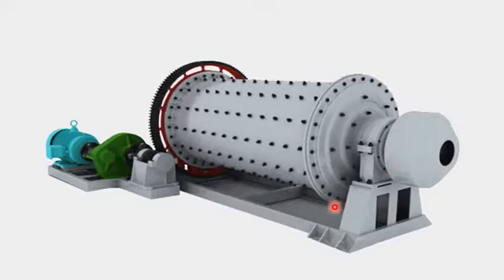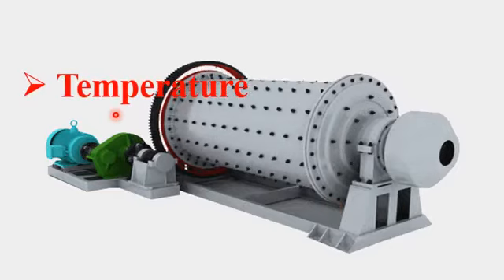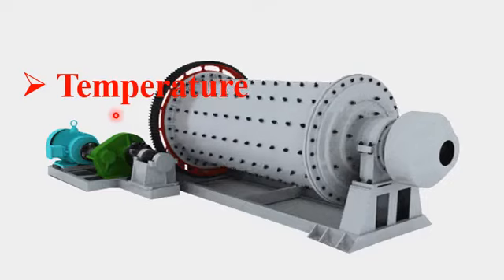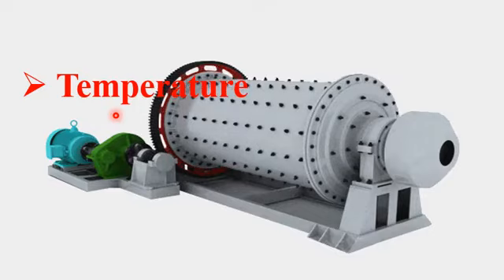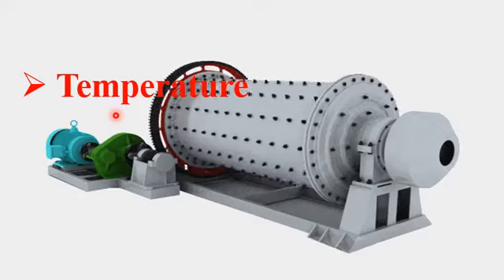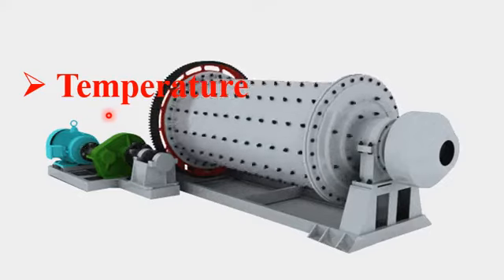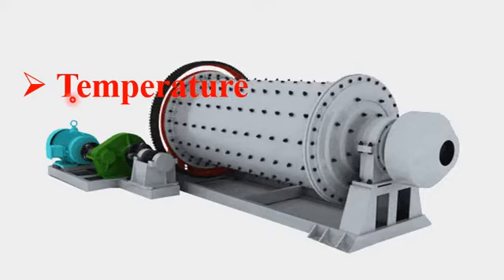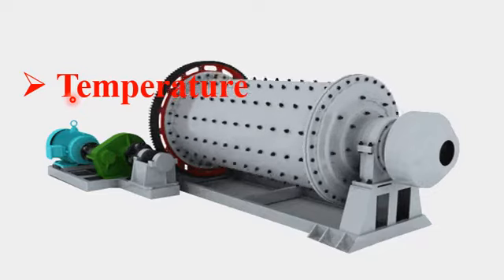So students, the first key physical parameter considered in a ball milling process is temperature. Please note that the temperature will be considered inside the ball milling drum or ball milling apparatus. Number two, the temperature of the precursor material or the bulk material is also considered.